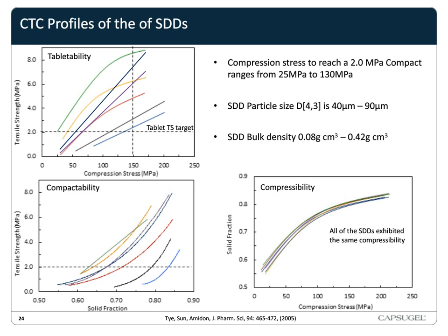Compressibility describes the volume reduction of a powder bed, in this case the SDD, in a confined space, in this case the die, caused by the application of force. This is generally similar for a given SDD formulation, but does not depend on particle surface area or morphology.